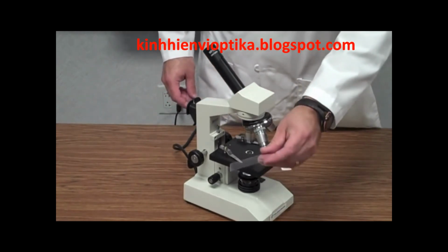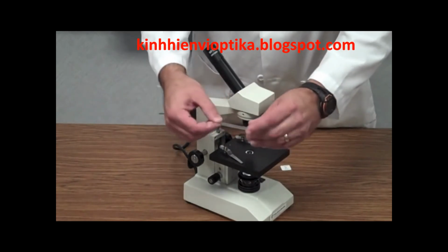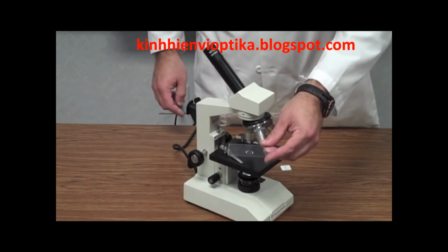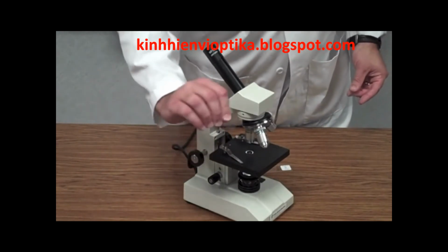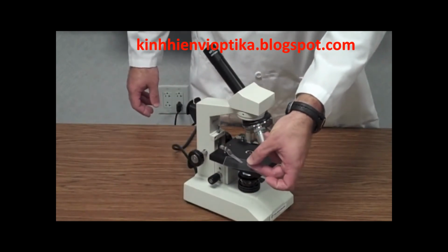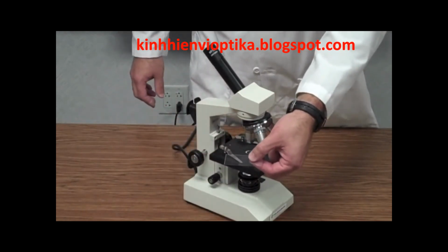This is a slide. They can either be plastic or glass. This one is plastic. It makes it a little bit more durable, but I can also use glass as a slide. I would put my specimen on here so that I can put it on the stage so I can see it. This right here is a cover slip. Cover slips are used to cover up the specimen on the slide. Okay, that way it keeps it in view and makes it easier to see.